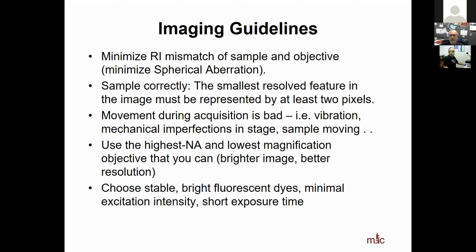Okay, so for this section, some take-home message or a recap. Typically, you will want your objective immersion medium, say oil immersion or water immersion, to be closely matched by the refractive index of your sample.